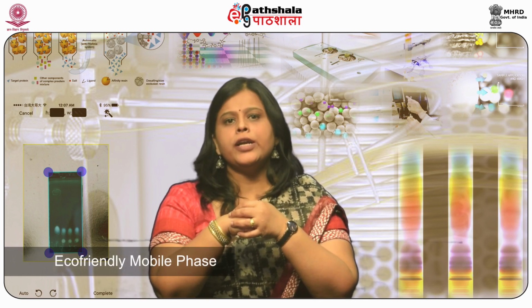Third, ability to analyze a wide variety of analytes. SFC can be applied to analyze many solutes without any derivatization. Analysis of thermolabile compounds. Due to low operating temperatures as compared to gas chromatography, SFC can be applied to thermolabile compounds also. It uses eco-friendly mobile phase. It offers a wider choice of detectors as compared to HPLC.